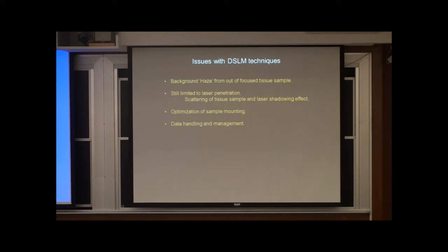And the second thing, which I think is a big issue in this kind of case, is that once I am taking this kind of images, it becomes a really large image. So these are easily one overnight experiment, like 600, 700 gig of data. So you have to do a lot of data handling, image processing and segmentation, and kind of automation in terms of getting some quantitative information out.